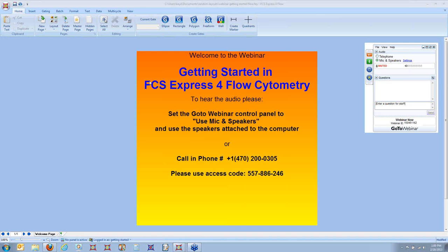People. We've been in business for about 15 years, and we have more than 4,000 customers worldwide, both in the clinical and the research realm. So hopefully what I'll be able to show you today is why so many people have started using FCS Express for their flow cytometry. Okay, so what is FCS Express?